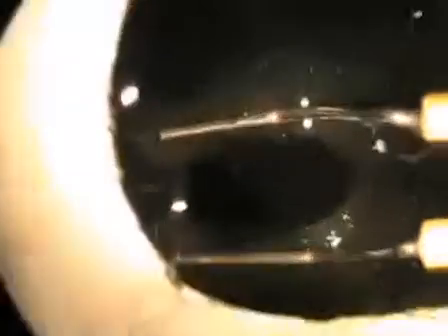The chick is a good model system because the embryos are very amenable to manipulation, and their large size also makes them much easier to work with than other embryos. Chick electroporation experiments also allow for the screening of a large number of genes in a short period of time.